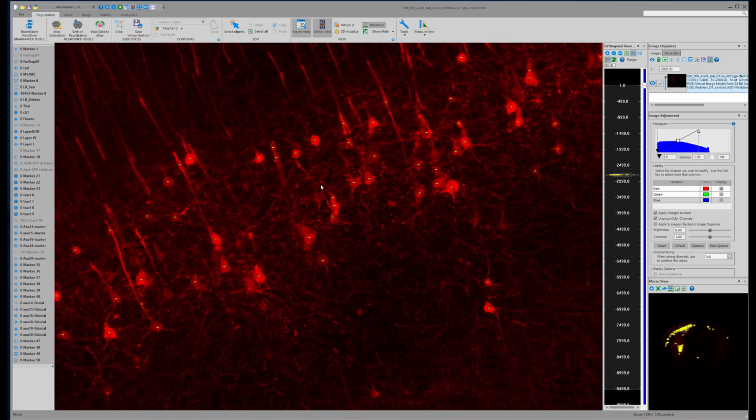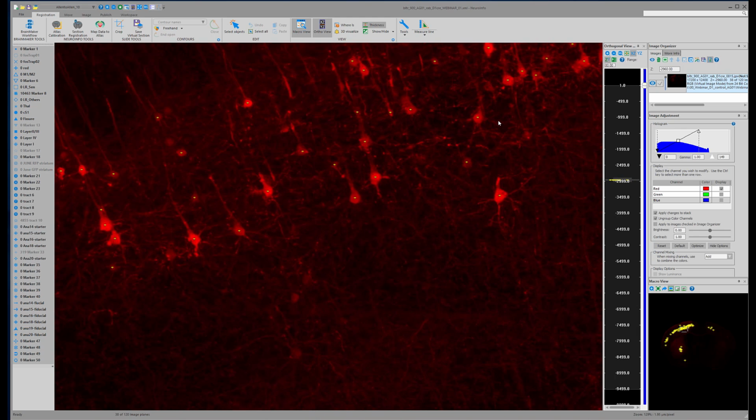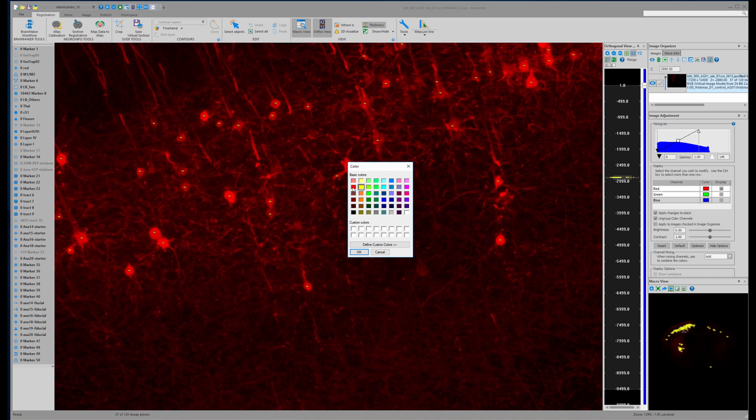For the most part, it's done a pretty good job of detecting all the neurons. Going to turn these back to red. There's a lot of things we can do.